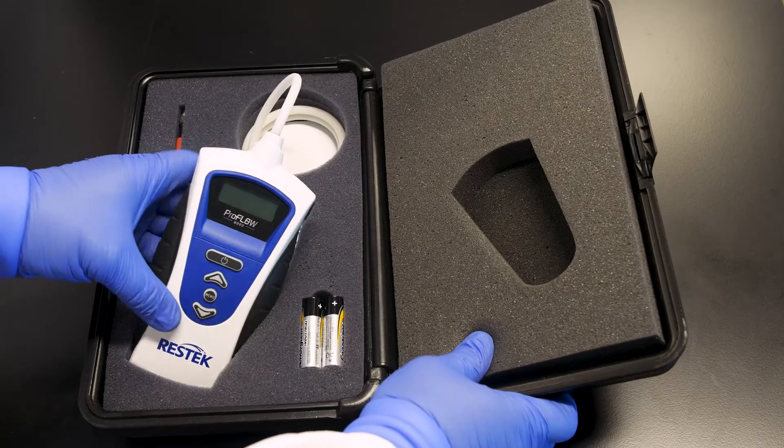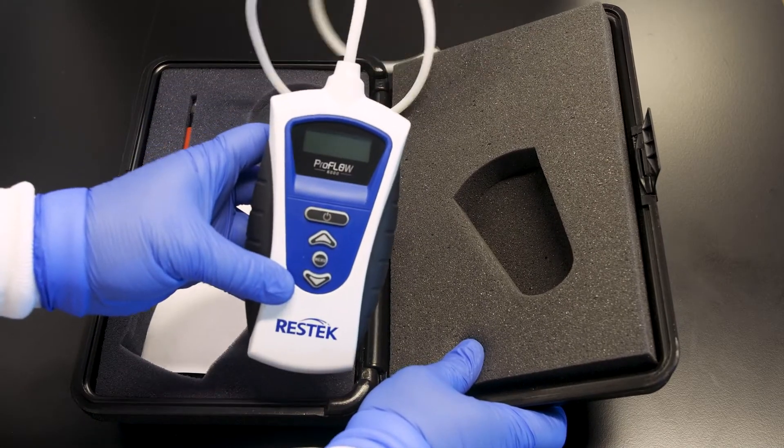Flow meters are often seen as essential tools for GC labs, but since modern instruments feature advanced pressure controls, valves, and built-in flow measurement software, is it necessary to have a handheld electronic flow meter?